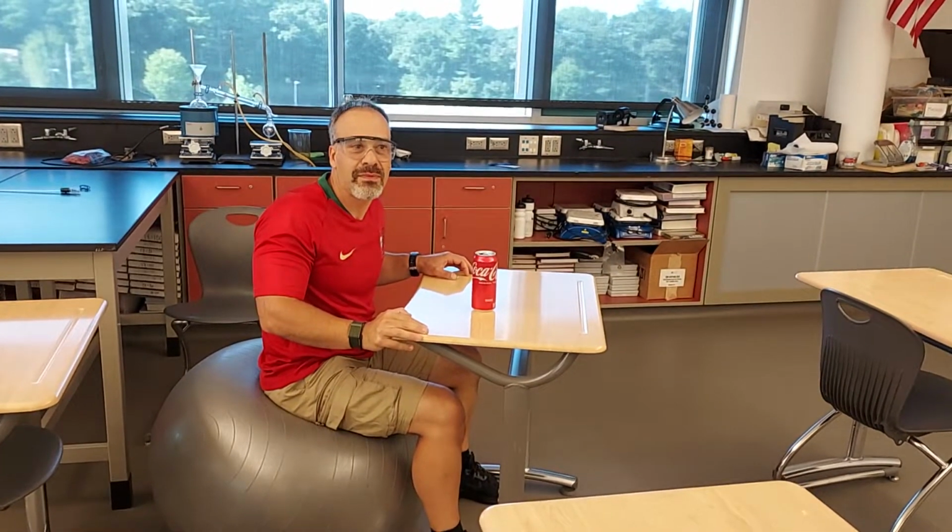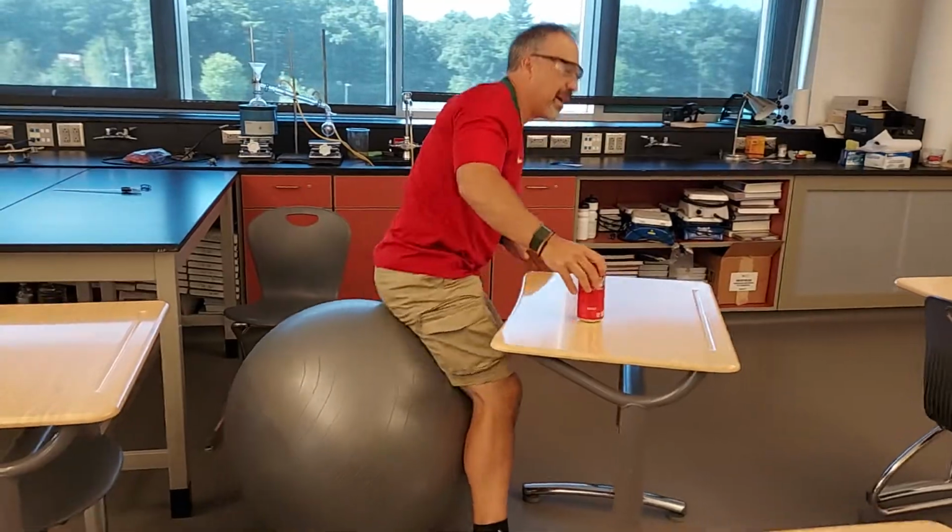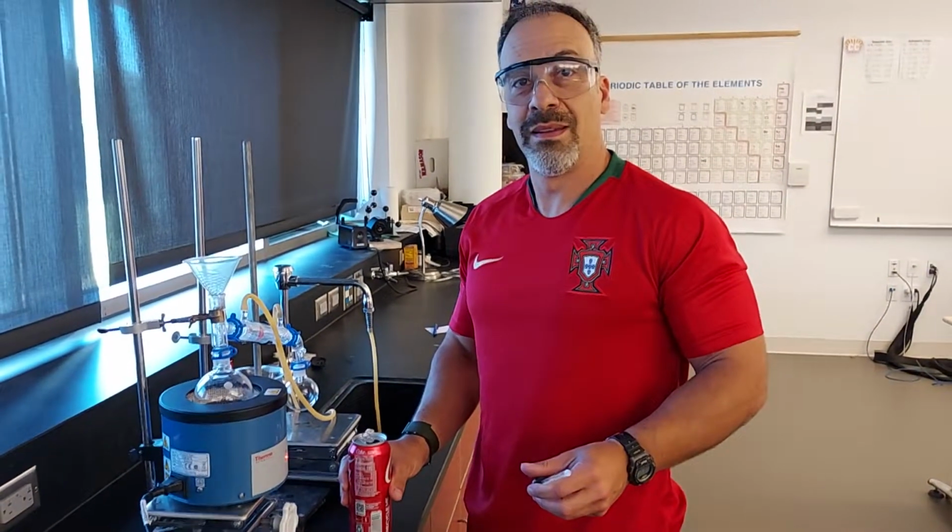I think maybe we could distill it. All right, we'll distill it. Make it happen. So, Dr. Velo, what do you got over here?